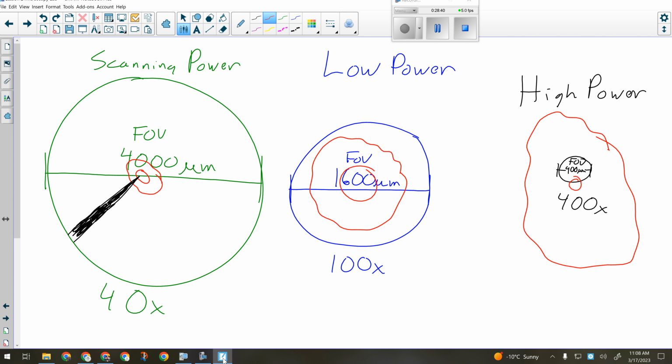I'm not saying you have to measure and actually calculate how big this thing is. I look at that and go, I think 5 of those could fit across. That makes it about, 4,000 divided by 5 is 800. Done. It's 800. So then I put in here.